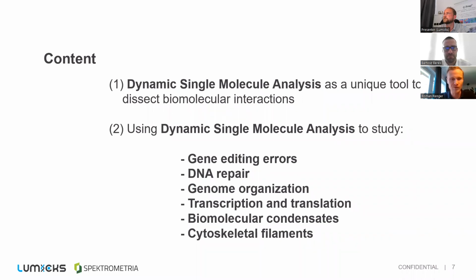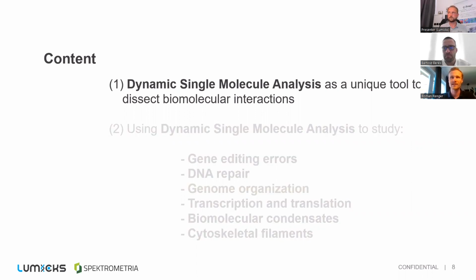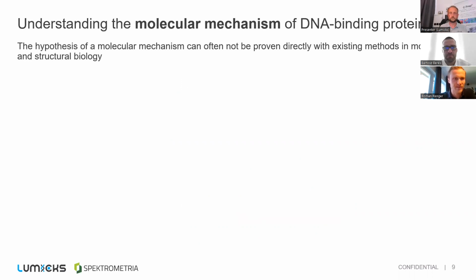And after having introduced this technology as a tool, I would like to dive a little bit into some real-world scientific applications where this technology has been used to study biological processes ranging from studying gene editing errors all the way down to how cytoskeletal filaments interact with each other. Let's start with the background information.